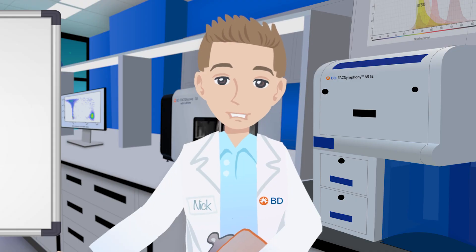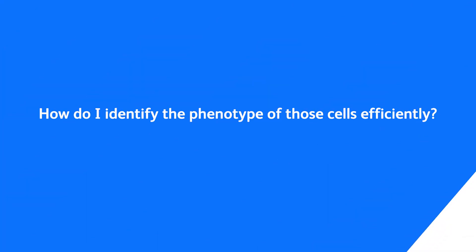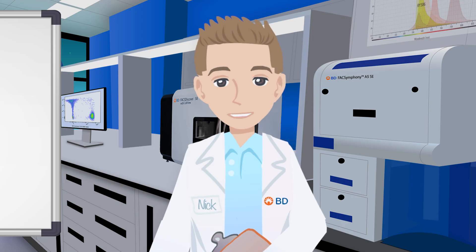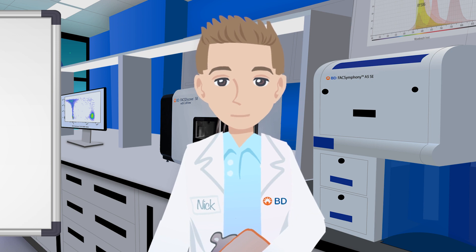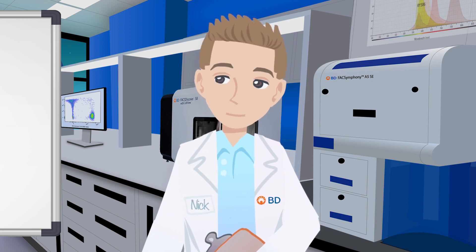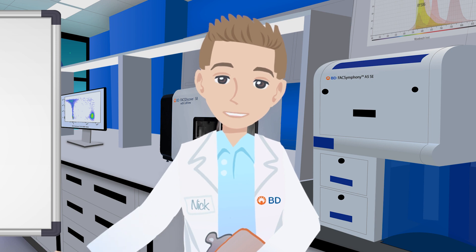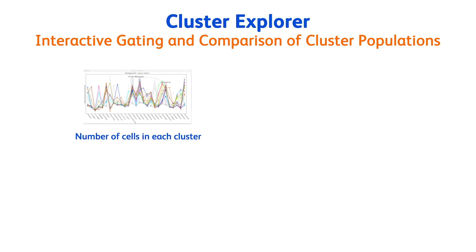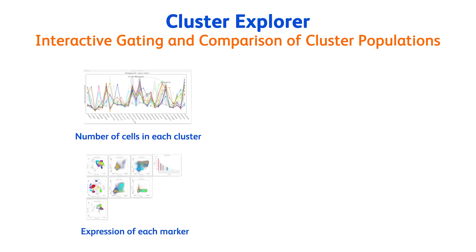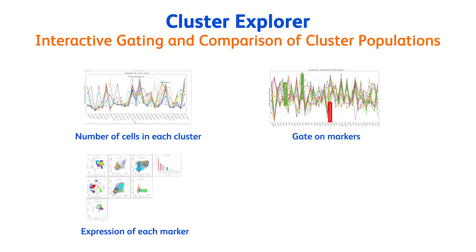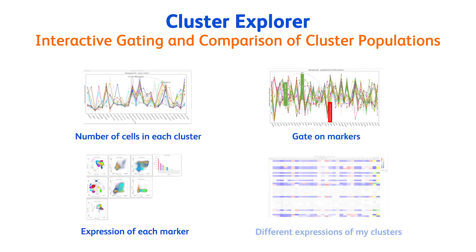Now I have my visualization and the different clusters. But how do I identify the phenotype of those cells efficiently and compare the expression between my experimental conditions? Thanks to the Cluster Explorer plugin, I will be able to complete the phenotyping and comparison steps. Cluster Explorer, via a series of interactive panels, lets me look at the number of cells in each cluster, the expression of each marker for each cluster, gate on markers, and see the expression of my clusters between my experimental conditions.